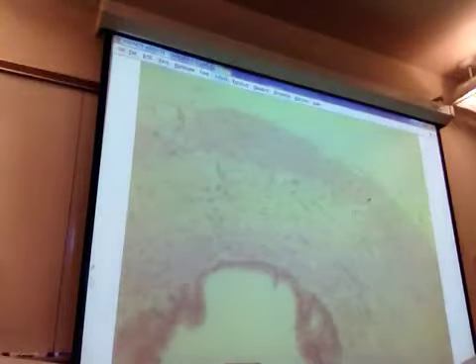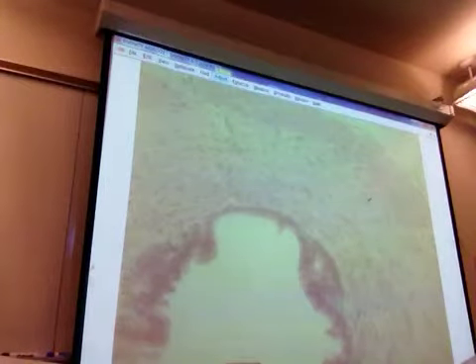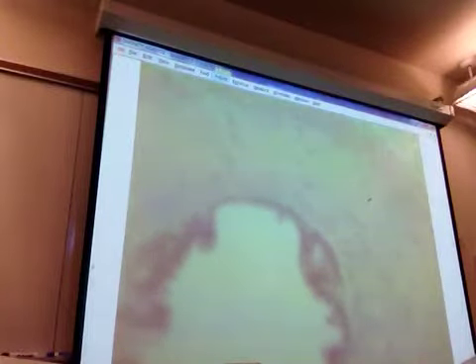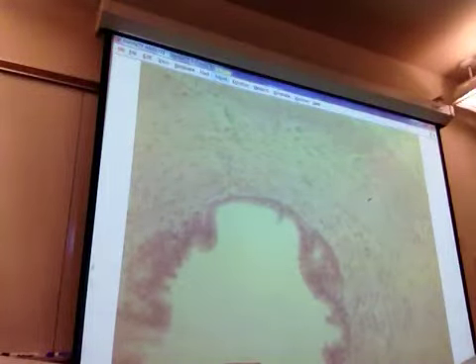What kind of epithelium is that? Is that pseudostratified? I think it's still pseudostratified at this point. So what is the main way that sperm moves in the vas deferens? Is it through peristaltic contractions? Yeah. Is there cilia in there still? There is not cilia in here yet. They get shorter and transition down as you get more out. Actually, this cut I think does have a little bit of cilia on it.